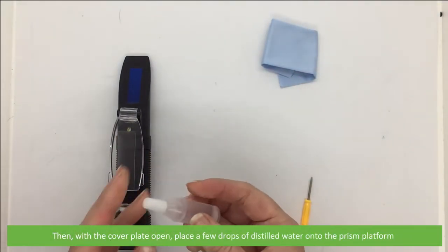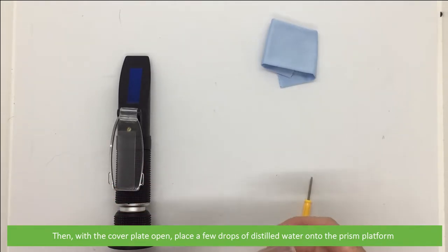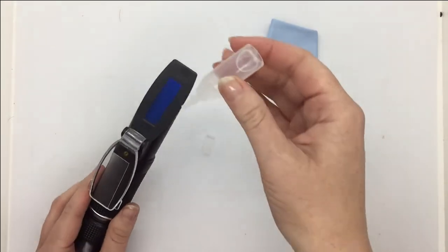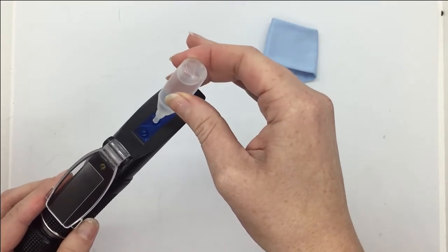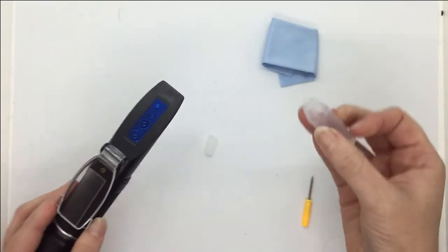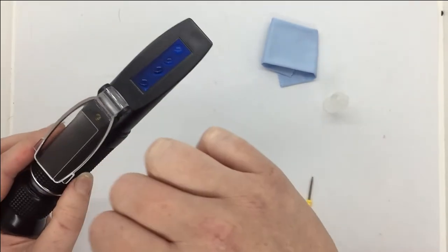Then with the cover plate open, place a few drops of distilled water onto the prism platform. Close the cover plate.